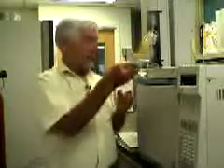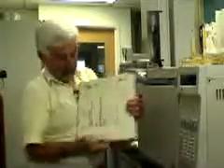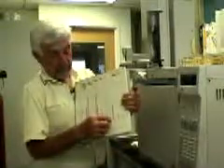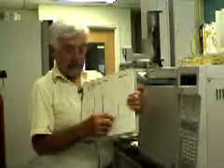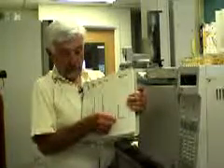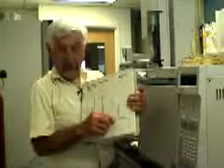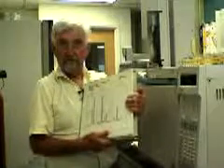What one ends up with is patterns that look like what's on the top of this manual, where you get different peaks. Each peak represents one chemical compound. And if one has an appropriate calibration, you can translate the height and the width of this peak into a concentration of one particular PCB congener.